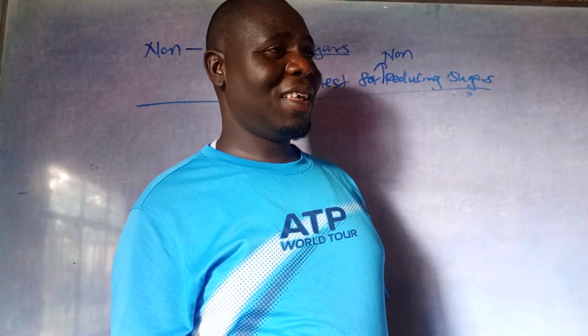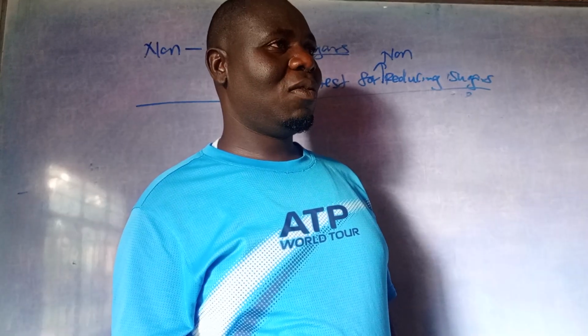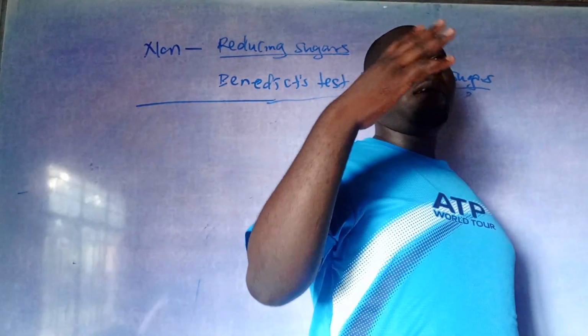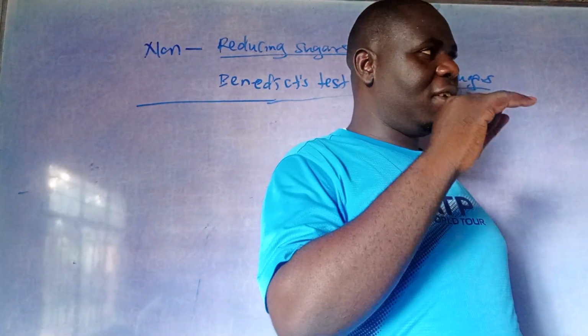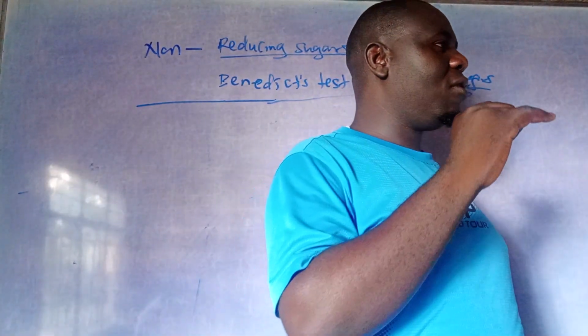The procedure is almost difficult, so be very careful. So now we will look together. Number 1, I said you first carry out the test for reducing sugar. So what's the procedure for testing for reducing sugar?